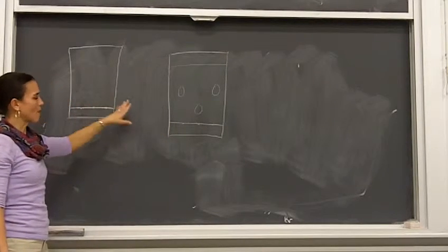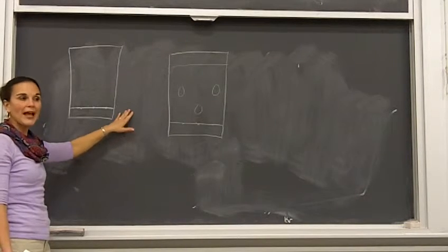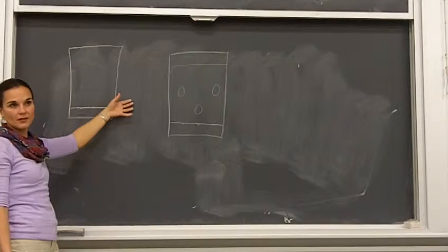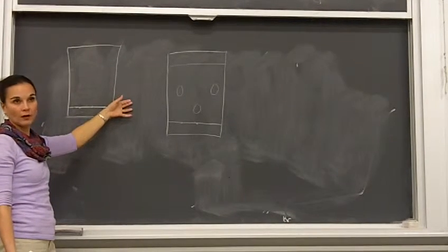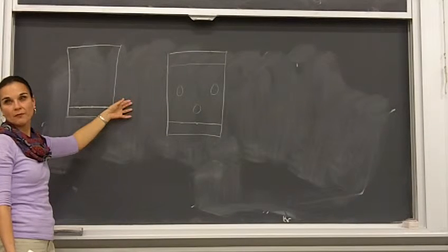So as far as compounds go, things that are relatively non-polar will hang out more with the relatively non-polar eluent. Things that are more polar will hang out more with the more polar silica, okay?